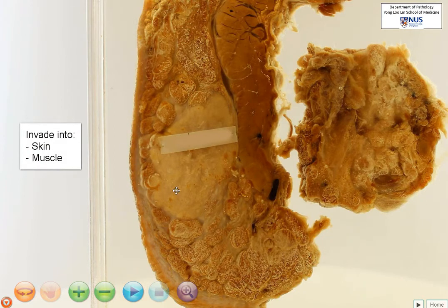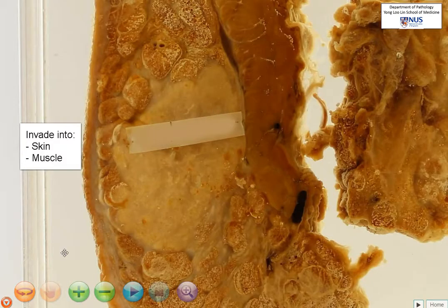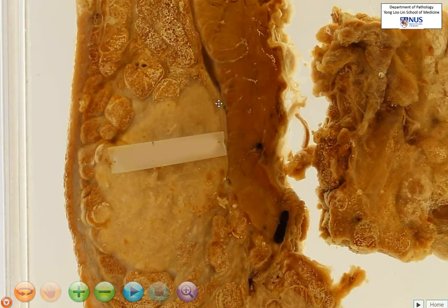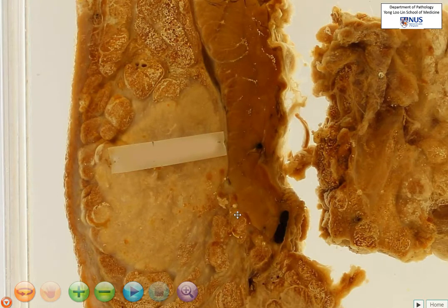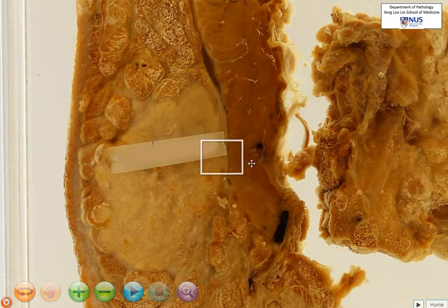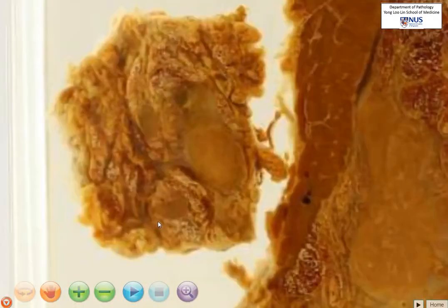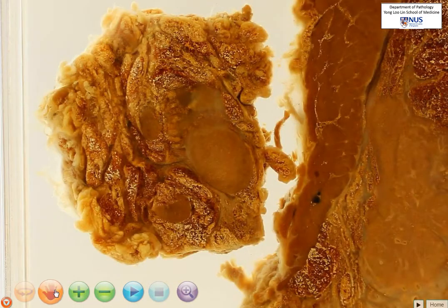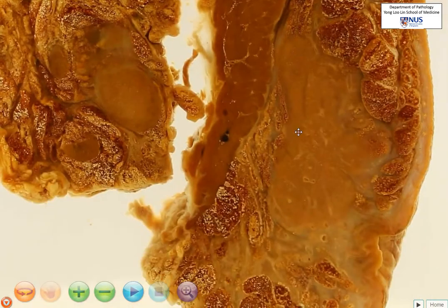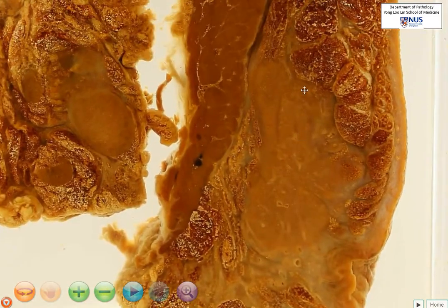This is important in the TNM staging. Posteriorly, it can also invade into the pectoralis muscle. So if we look carefully here, it does not appear that it is directly invading into the muscle, at least not grossly. I would take a microscopic section from here to examine to see whether my gross impression is confirmed. Turning it around, it does not really appear to be directly invading into the muscle.